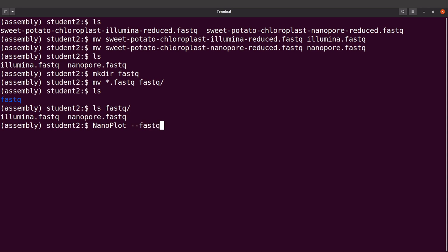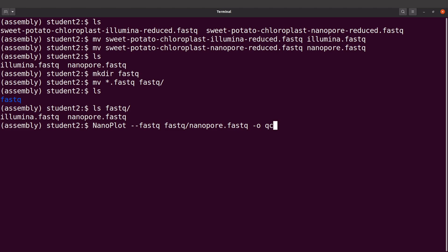I'll say --fastq and then supply it with the Nanopore data, so I'll say fastq slash nanoport dot fastq. Then I'll say -o and I'll say qc. The -o flag tells NanoPlot that we want the reports to be saved in this directory, so this directory will be created. Let's run this command.